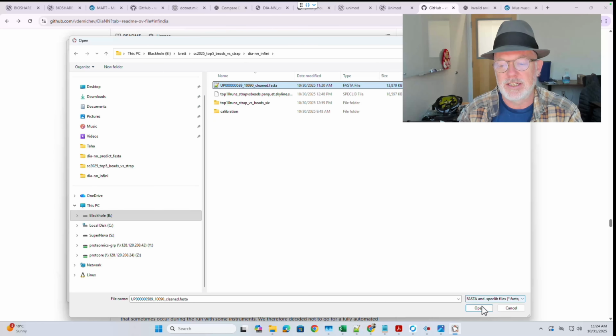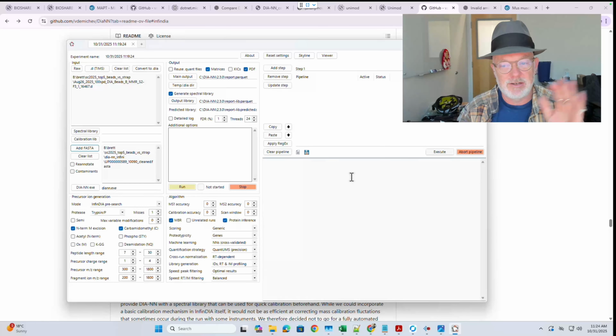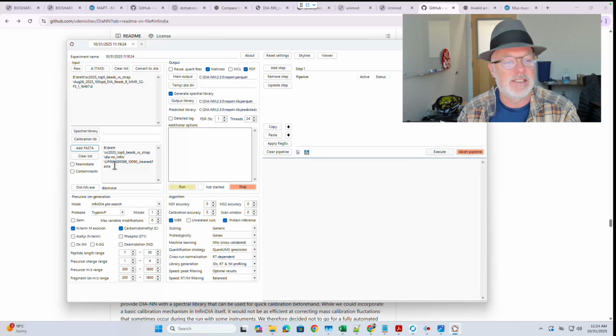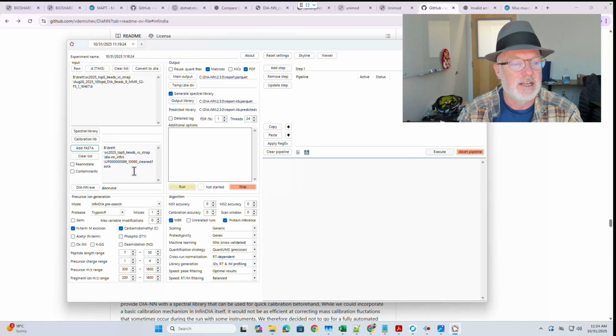And there it is. It was clean. So I just put it through ChatGPT and I said remove all non-standard amino acids besides U and O. And I think it removed B and Z. So as long as you remove the B and Z amino acids, you should be fine. And those again are, I think, deamidation when it's ambiguous. So there's a couple of these in mouse. There's 6 of them in mouse apparently. There's none in human. So if you're going to search it with mouse, it'll crash until you cleaned it.